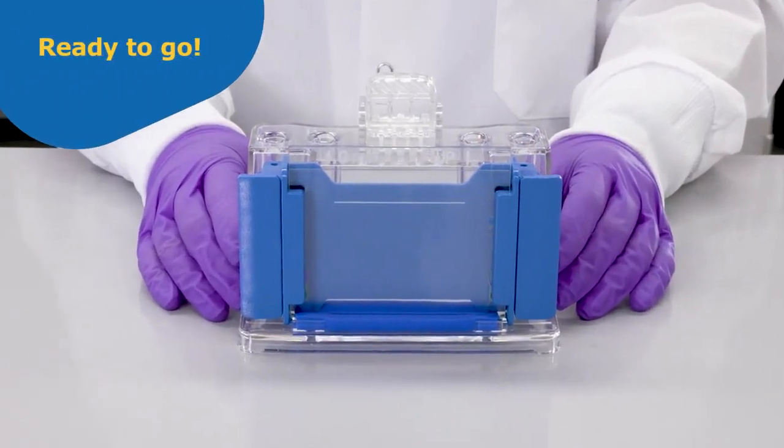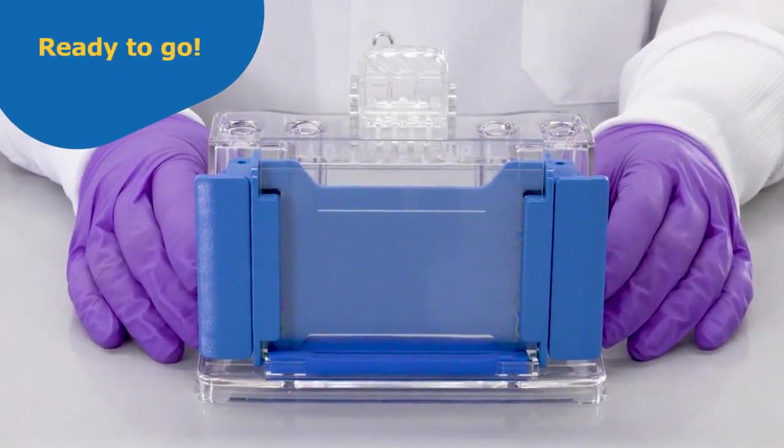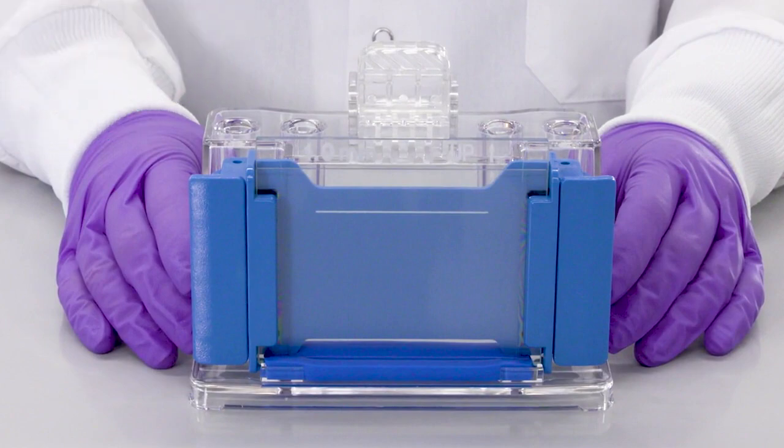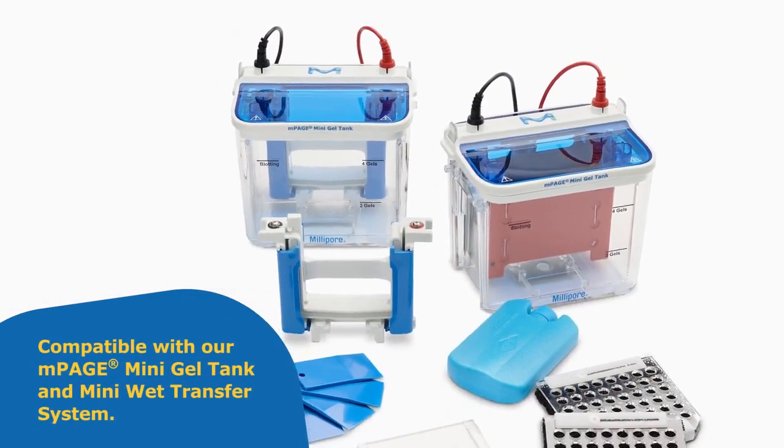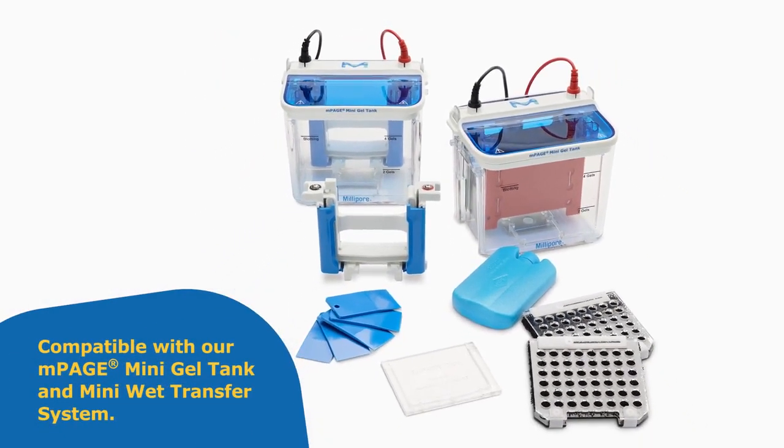You are now ready to cast your gel. Gels cast with the mPage gel caster are compatible with our mPage mini gel tank and mini wet transfer system.